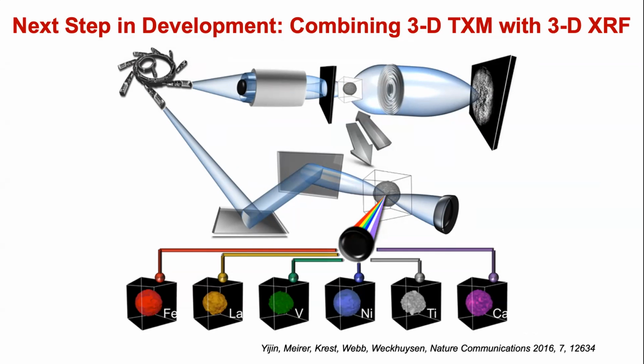And we took a particle, we measured the top X-ray, transmission X-ray microscopy, and then we also measured the same particle with X-ray fluorescence. Now the fun thing is, and that's also a long story, we actually had at some point almost like a suitcase with catalyst particles. And we traveled with these particles and we had several to analyze. So it sounds a bit funny, but it's really like you do the science, because you want to make sure that you measure the particles with the same technique. Because we did not only this, we also, for example, did fluorescence microscopy and things like that.